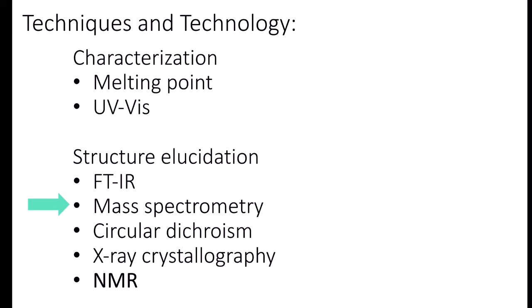Mass spectrometry. This instrument gives the molar mass of the molecules and its fragments. Based on the fragments, you will get a fragmentation pattern and you will have an idea how atoms are connected. To help explain this further, let us watch a video.